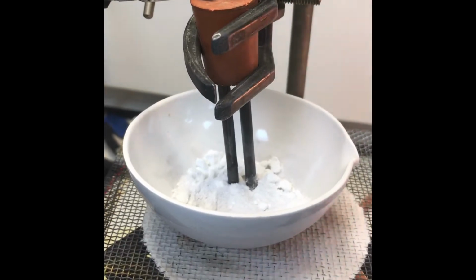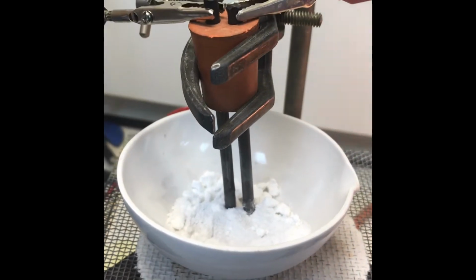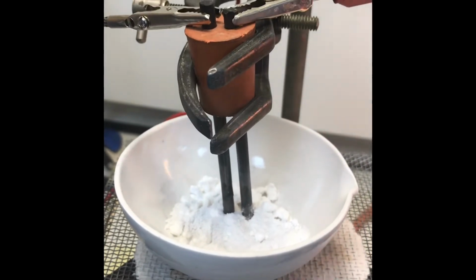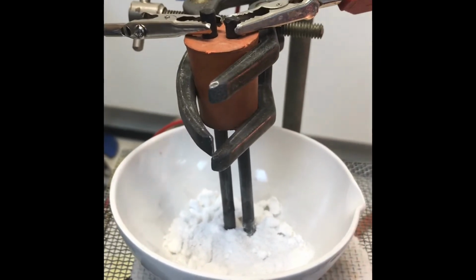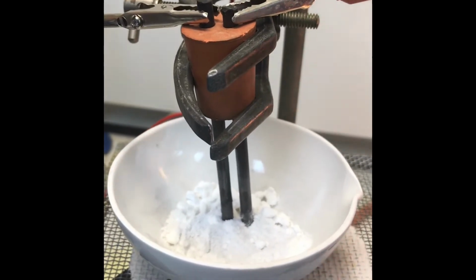In this experiment we're going to look at the electrolysis of lead bromide. So remember, electrolysis is the breakdown of a substance using electricity. This can happen with ionically bonded compounds, providing the ions are free to move.